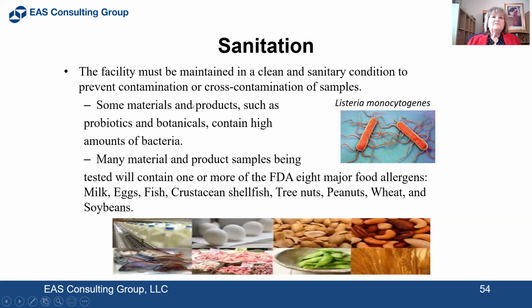So the facility must be maintained in a clean and sanitary condition to prevent contamination or cross-contamination of samples. There are some materials and products such as probiotics and botanicals that have high amounts of bacteria. And then you're also going to be dealing with the major food allergens. You want to make sure that your samples don't get cross-contaminated.